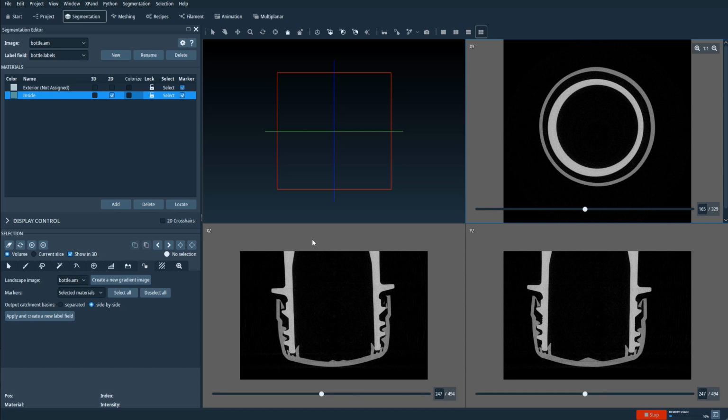So this might not make sense at all for now. That's why I wanted to first demonstrate how it works, and then later on explain in more detail what's going on.